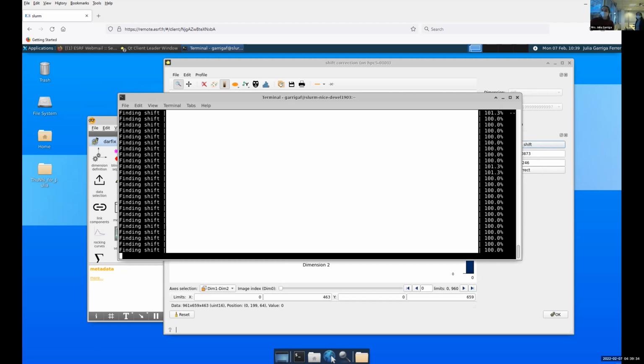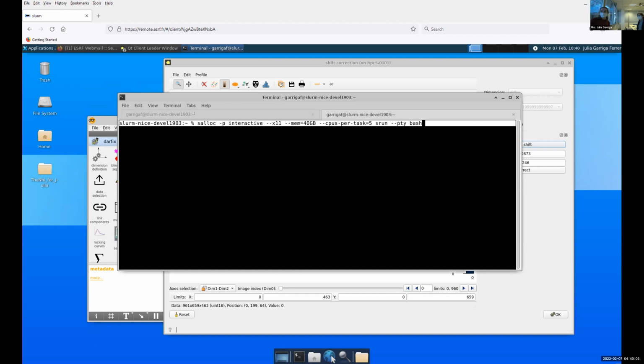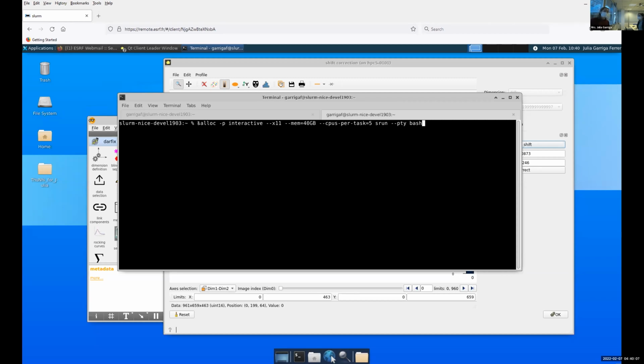Okay, I can connect now. Good. If you can connect now, do you want us to go back and maybe see again the different steps? I can open a new session now just to show you the different steps you should follow. Basically, first of all, you have to enter the allocation command line to allocate the memory. It's this one. You can copy it from the chat on Zoom. We wait for 30 seconds, and then after this, you can open the graphics environment, which I will show you now. It's the second message I sent in the chat.